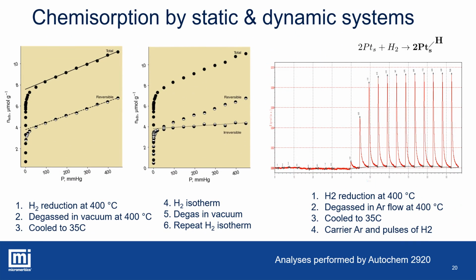During the chemisorption process, the reactive molecules interact with the active surface, often according to two different types of binding, irreversible and reversible chemisorption. Irreversible chemisorption produces a stable chemical compound at the catalyst surface. Examples can be metal hydrides or oxides that are stable at the analysis temperature even when the reactive phase is removed. Reversible chemisorption is generated by weak interactions that might take place on energetically disadvantaged active sites or on an activated support. The bonds in this second type of chemisorption are very weak, and it is sufficient to remove the probe gas from the gaseous phase to break such light binding, desorbing the gas molecule.